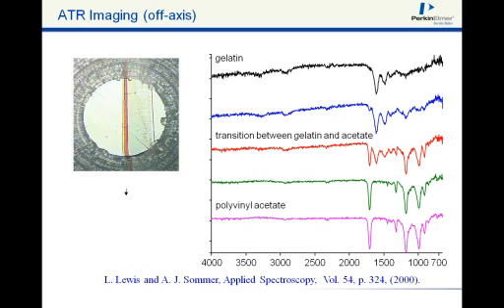So here's an example. This is an old one, photographic film with multiple layers on it. And starting at the edge, you get a gelatin layer. The gelatin layers contain all the pigments, if you will, or the things that are photosensitive. And then towards the end of the film, you get the support layers of polyvinyl acetate.